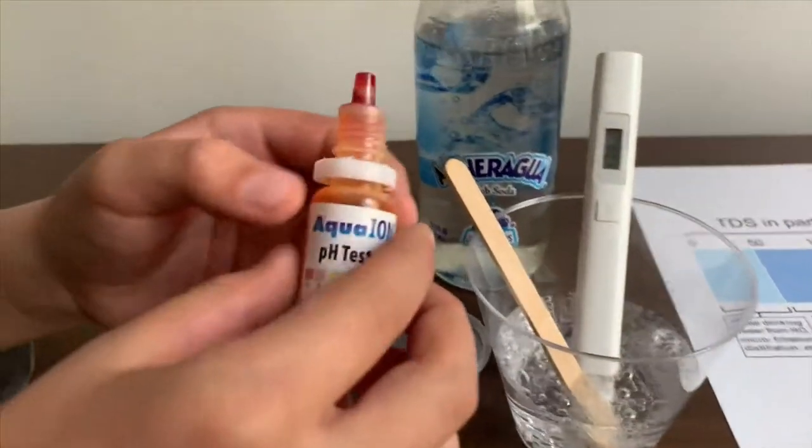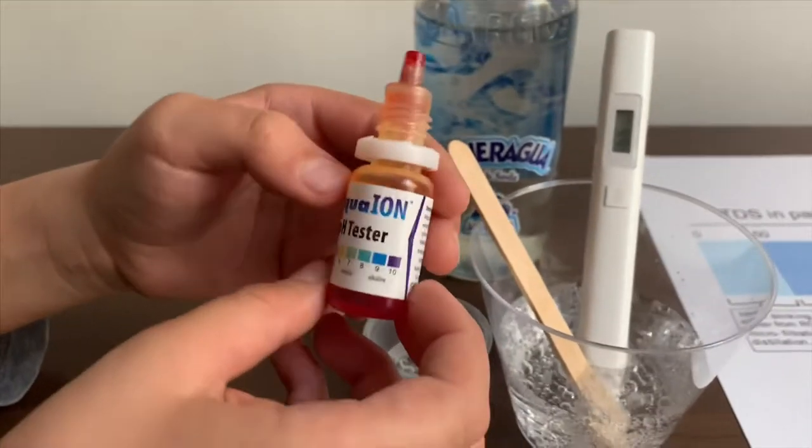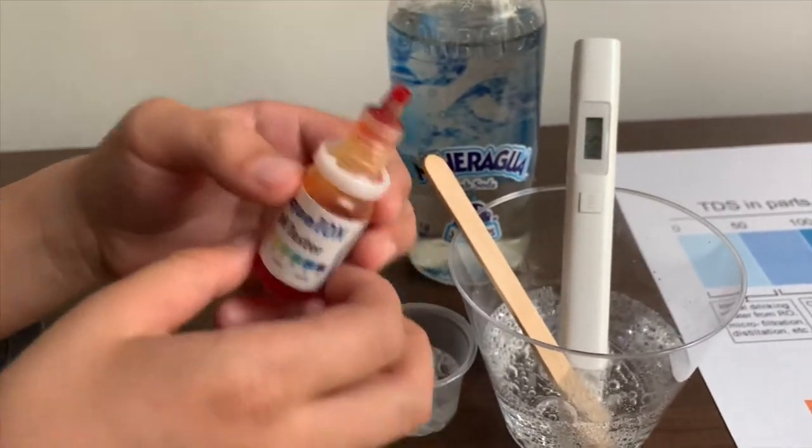Now let's test the pH level. If you want to buy this pH tester, the link is down below too.